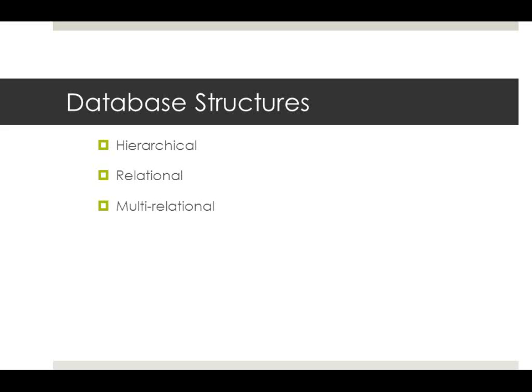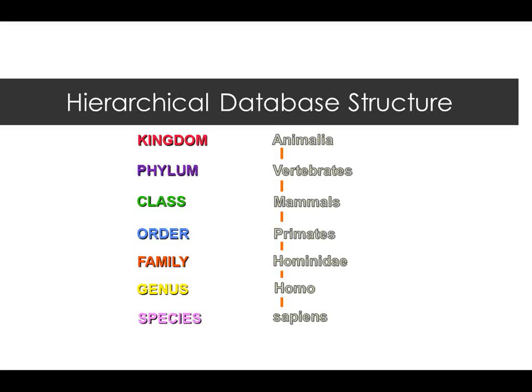So going back to the ground, talking a little bit about database structures, because in reality, computers, especially EHRs and those kinds of things, are really multi-relational databases, and they use that data to then do all the things that they do. So understanding a little bit about database structures is going to be important for us.